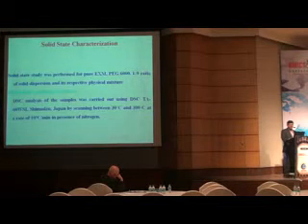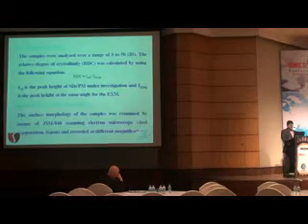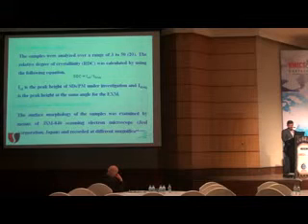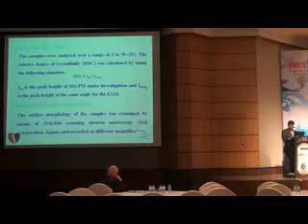Further, the solid dispersions obtained were studied for solid state characterization using DSC, differential scanning calorimetry. The samples studied were pure exemestane, pure polyethylene glycol 6000, the 1:9 ratio of solid dispersion, and its respective 1:9 ratio of physical mixture. The DSC analysis was carried out at a scanning range between 30 degrees centigrade and 300 degrees centigrade at 10 degrees centigrade per minute.